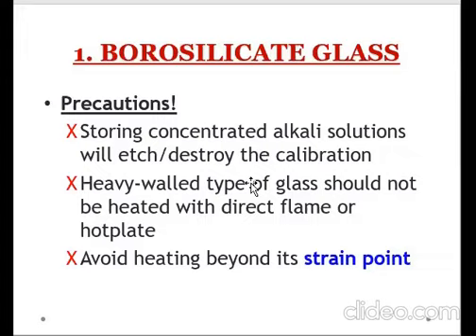Ang lalamig una ay yung nasa labas ng glass, ng heavy wall na glass. And then yung nasa loob, mainit pa rin. Okay? So ang mangyayari yan, magkakaroon ng conflict. Okay? Sa behavior ng particles sa glass, and then later on, that could result to the cracking or the break of the glass. Okay?